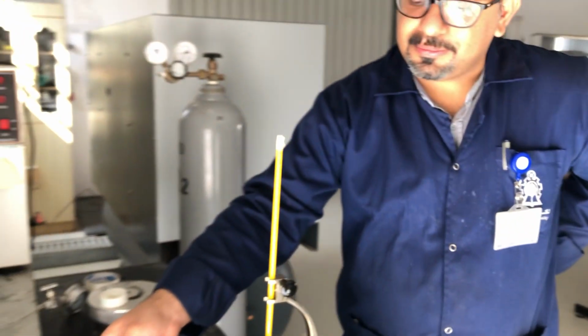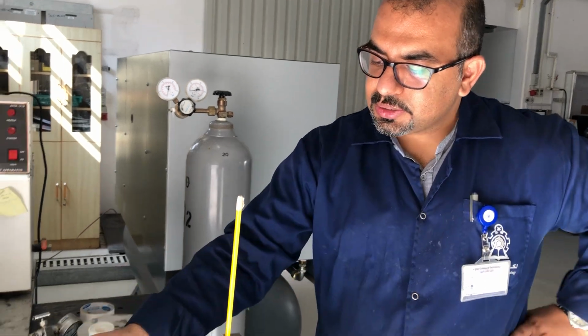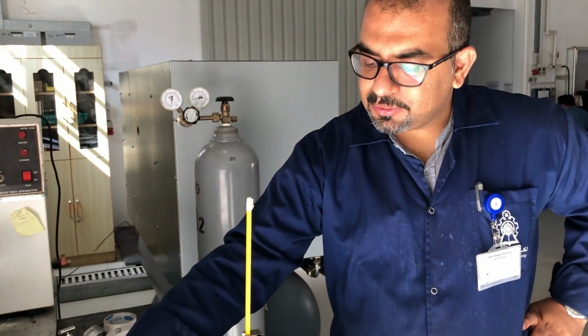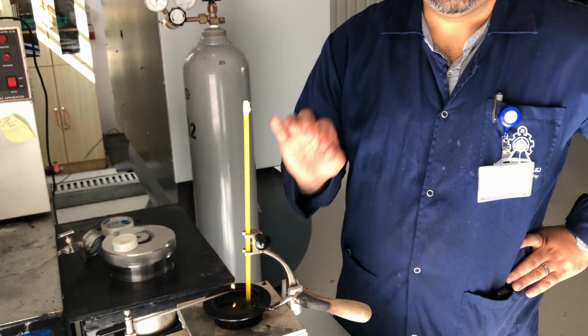It means that for a second or less than a second, the fire will come and vanish. It will not sustain. Because we don't know at what temperature it happens, we have to keep doing this process and record the temperature. The first temperature at which we observe the first flash is the flash point temperature.